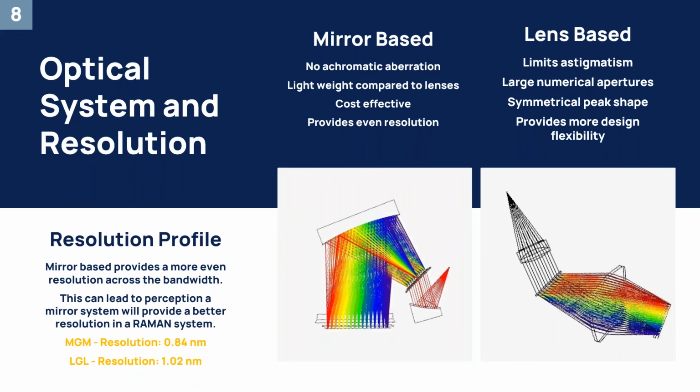And we can look at that a little bit more in detail by saying, the optical system itself, it's common to either use mirrors or use lenses as the optical systems building components, I guess you could say. And there are pros and cons to both. There's no right or wrong answers here, but considering the different strengths and weaknesses is of course a good idea to pick the optimal design.